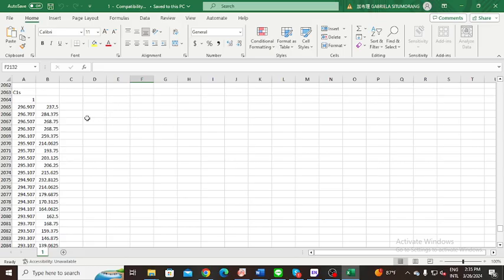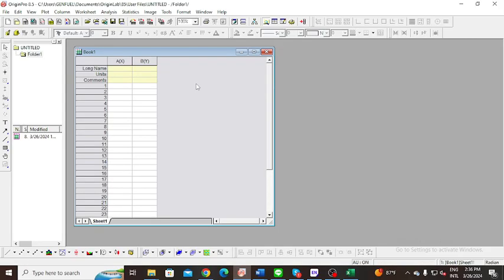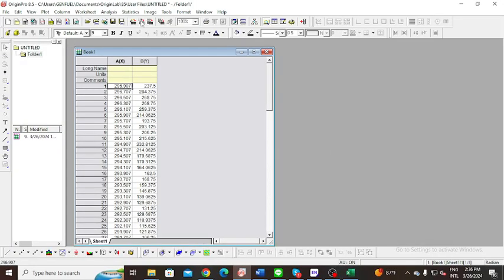So usually we get the data from the research center. It's like this, and I'll just show you how to do it with carbon, because it has a lot of elements. So just copy from the Excel. For this one, it's only for carbon, and then later you just do it for the different components. It depends on what you need, because I also use carbon.